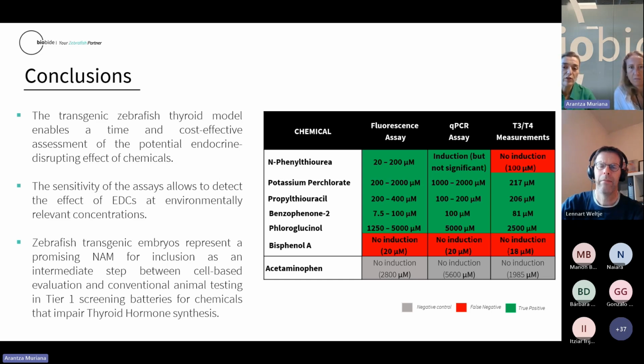Just to add some information, I don't know if you are used to working with zebrafish, but in this case we are not giving the drug orally or intravenously. We are putting it in the media, dissolved in water with some DMSO. And usually, if we measure the bioavailability of the compound itself in the embryo, even when we get a really high concentration inside the embryo, we reach at most 30% of the concentration that we originally put in the media.